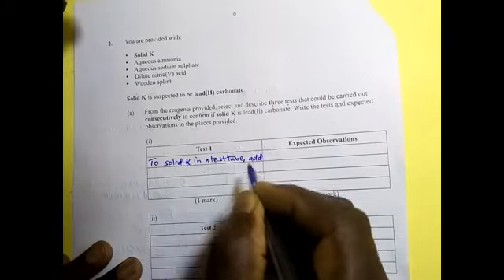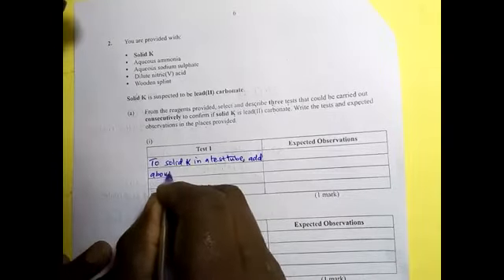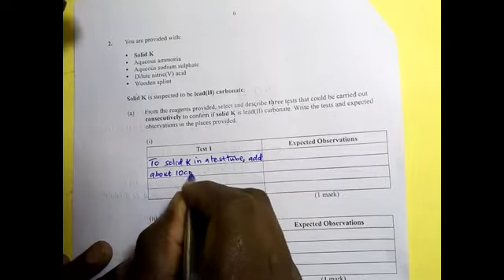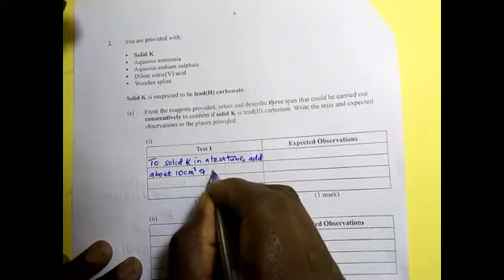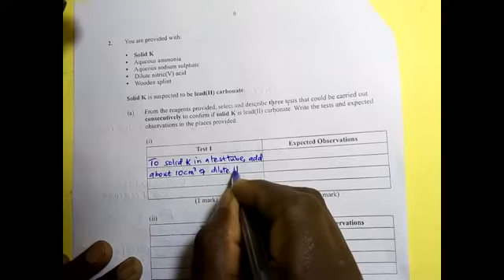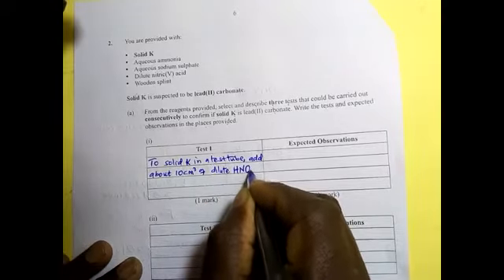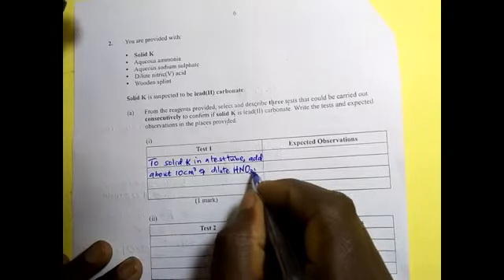Add about 10 cm³ of the dilute nitric acid provided. And then you retain the reaction.